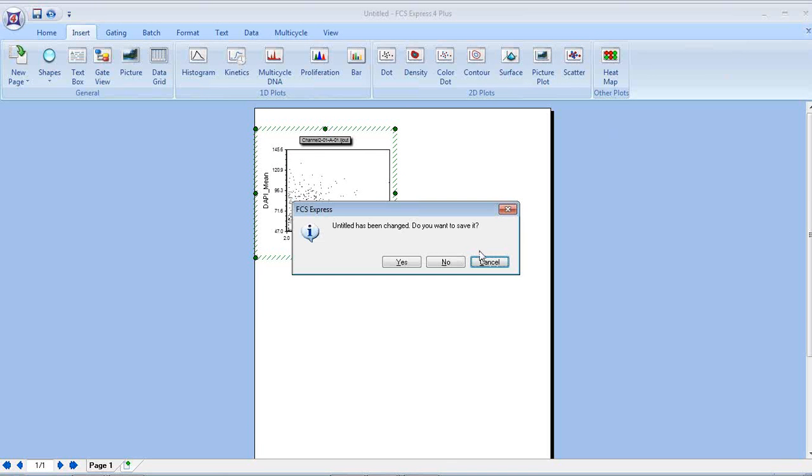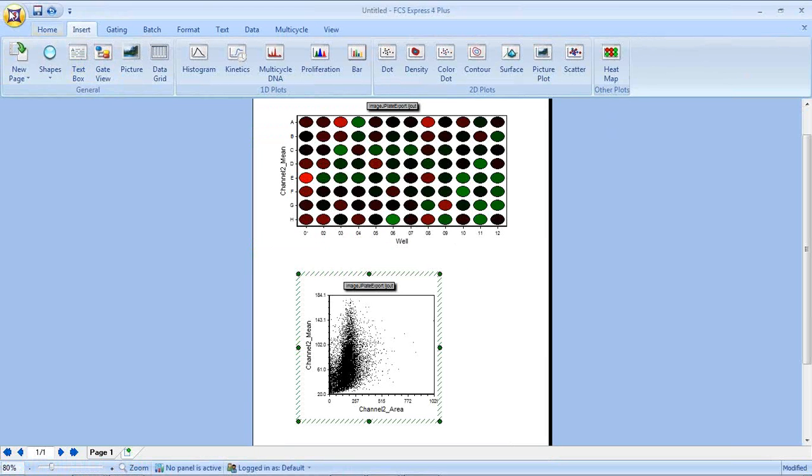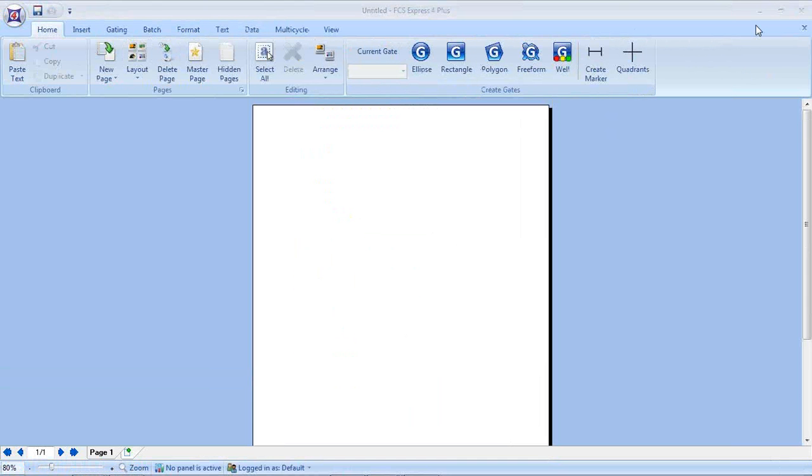And let's talk a little bit about FCS Express first. So we are actually in FCS Express. You may notice that the format that we're in right now looks very much like Microsoft PowerPoint, very much like Microsoft Word, or Microsoft Office in general. The team at Novo Software has done this very kind of shamelessly. We like everything to look like Microsoft PowerPoint or Office. That way you don't need much experience to come in and start using the software itself.